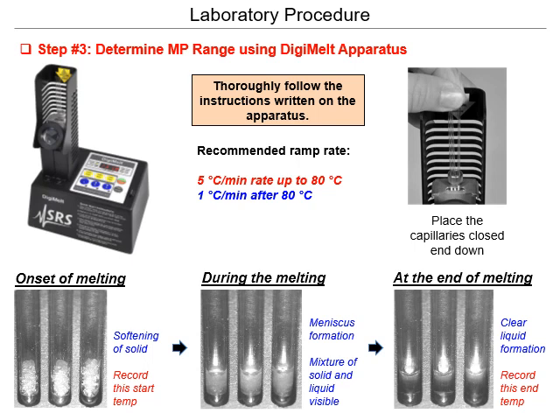And you've got to slide those all the way down, and when you look through the glass, there's a little light that shines to the back so you can actually see it. And what you're going to do is set a climb rate for the temperature, which is called a ramp rate, and then you're going to set a hold temperature, something around 80 degrees Celsius is what we're looking for.